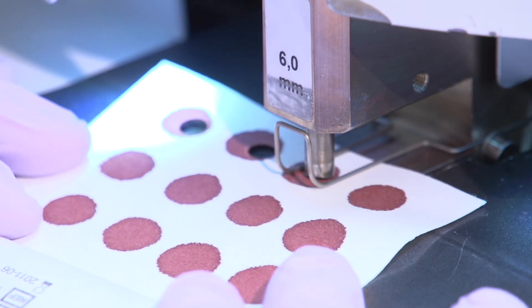What we do with that blood is punch it out and rehydrate it so that it becomes basically equivalent to serum. The reason we went to blood spot testing is because we could test more hormones in a blood spot than we could in saliva.